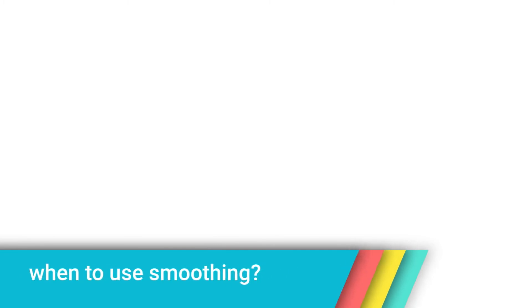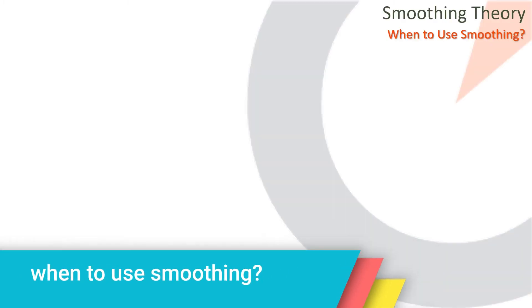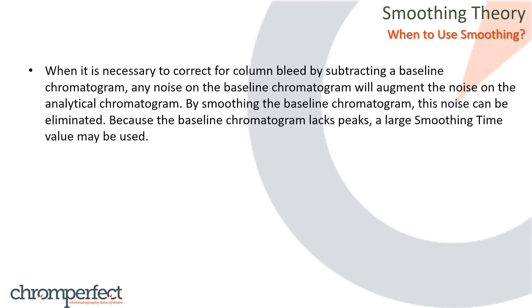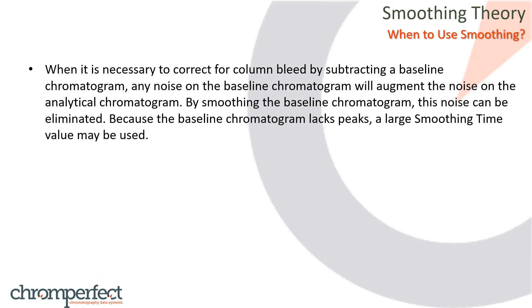When to use smoothing. Smoothing is not always necessary and should be used only when there is a good reason. Here are some typical situations in which smoothing is indicated. When it is necessary to correct for column bleed by subtracting a baseline chromatogram, any noise on the baseline chromatogram will augment the noise on the analytical chromatogram. By smoothing the baseline chromatogram, this noise can be eliminated. Because the baseline chromatogram lacks peaks, a large smoothing time value may be used.